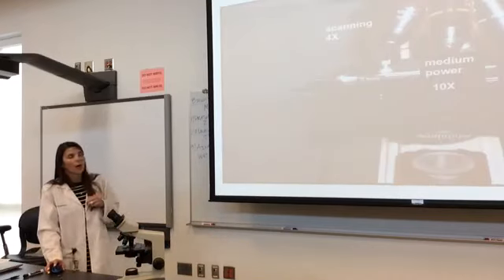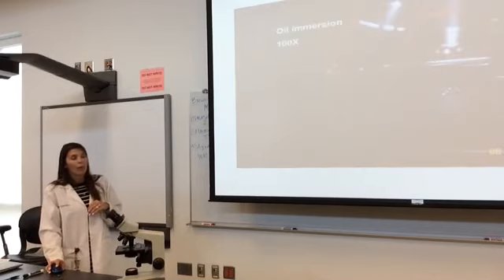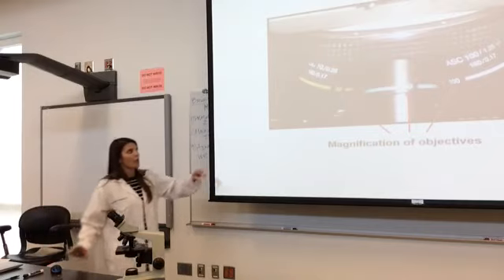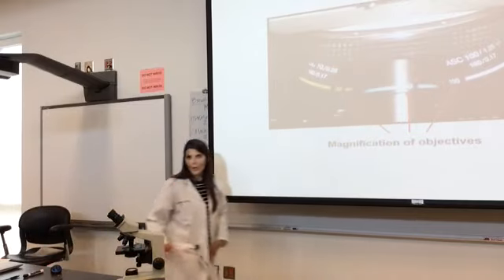So this goes through the powers. So I've already kind of gone through that. And the oil immersion is one that you will not use. You will not engage the white objective. Okay? It's showing you that it's pointing towards the magnification of those objectives, which you and I discussed.